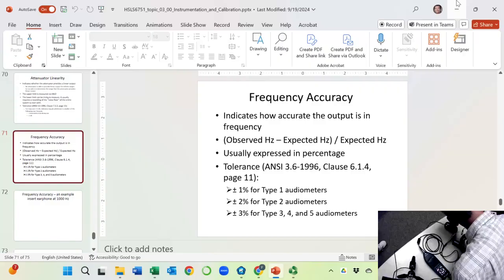Then I want to measure, so I need to move the cursor. You see two vertical lines? Are you able to see that? The first one, let me move it to align with the first peak as much as I can. And then the second cursor, move it to align with the second peak as much as I can.